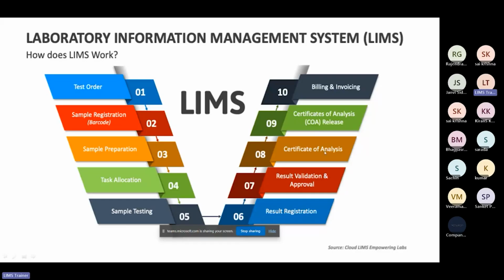If you have faced such situations, this is what the laboratory or the manager needs. After this, the certificate of analysis will be released, for a blend release or an assay release. This release will be utilized for that particular batch record.